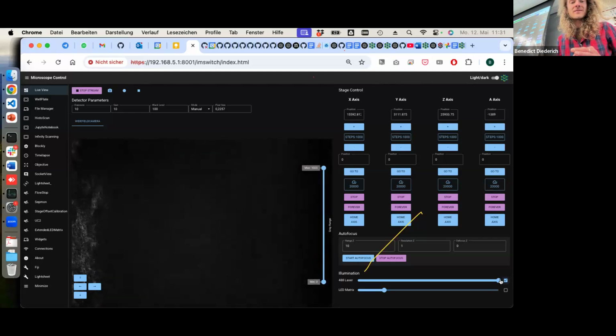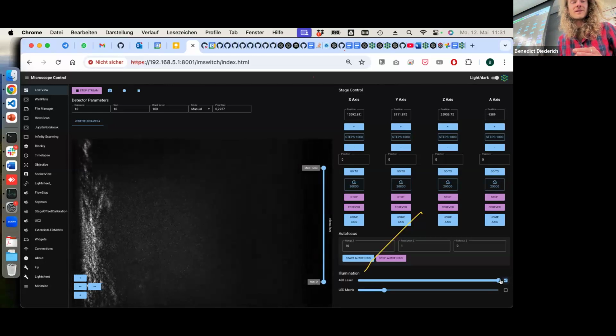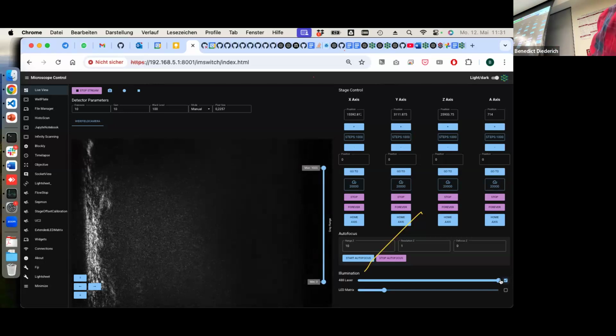Also not sure what exactly we're looking at right now. Anyway, last approach. Well, if not now, then maybe later. I think also the camera. Anyway, I'll try it out in a second again.